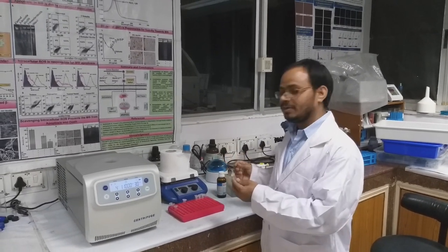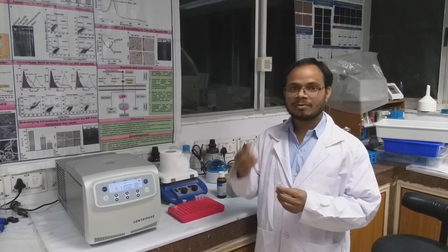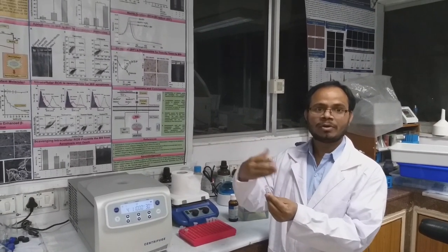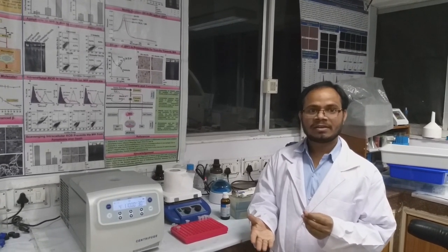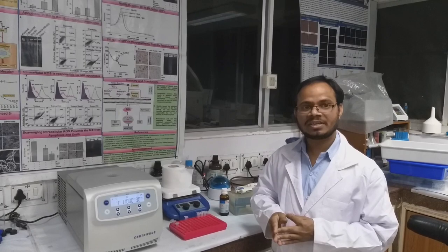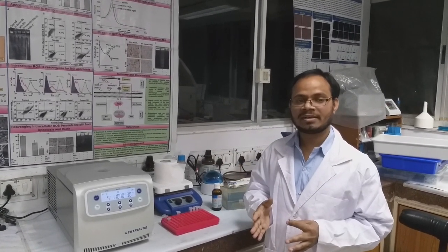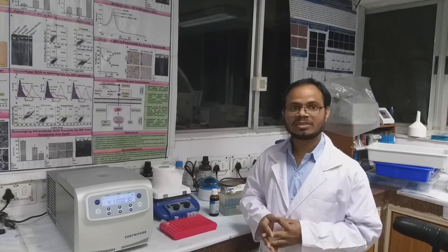Once we mix with the phenol chloroform, since DNA tends to solubilize in water, the DNA remains soluble in water, and whatever the other content, protein or other materials, they go into the phenol based medium. So once we centrifuge that, we collect the water based layer, and again we go for silica based purification, or we can use isopropanol precipitation followed by washing with 70% ethanol, then resuspending it in deionized nuclease free water.